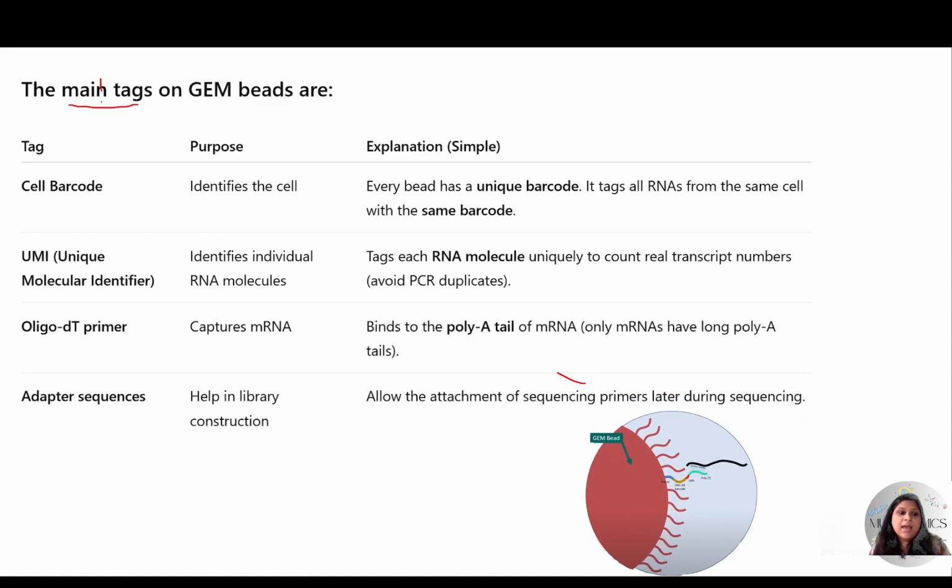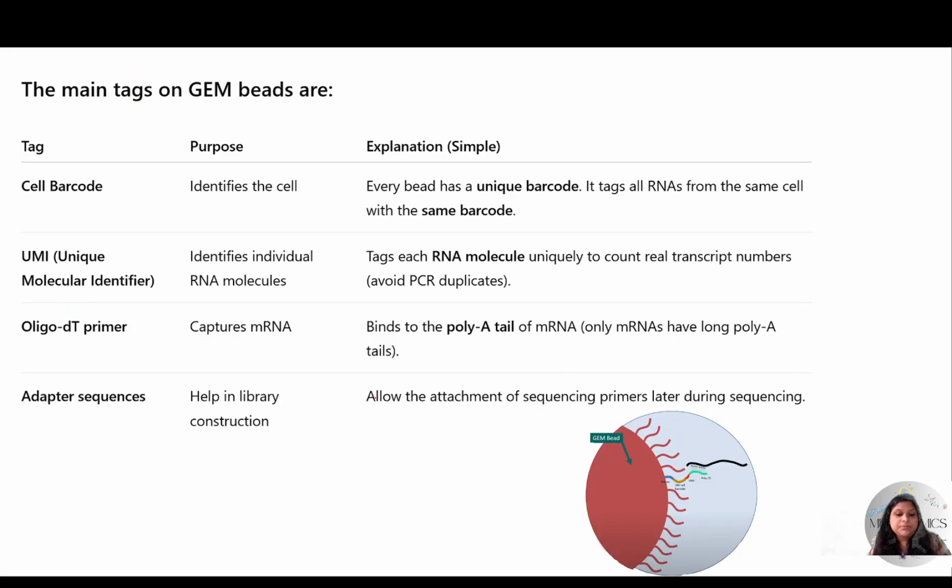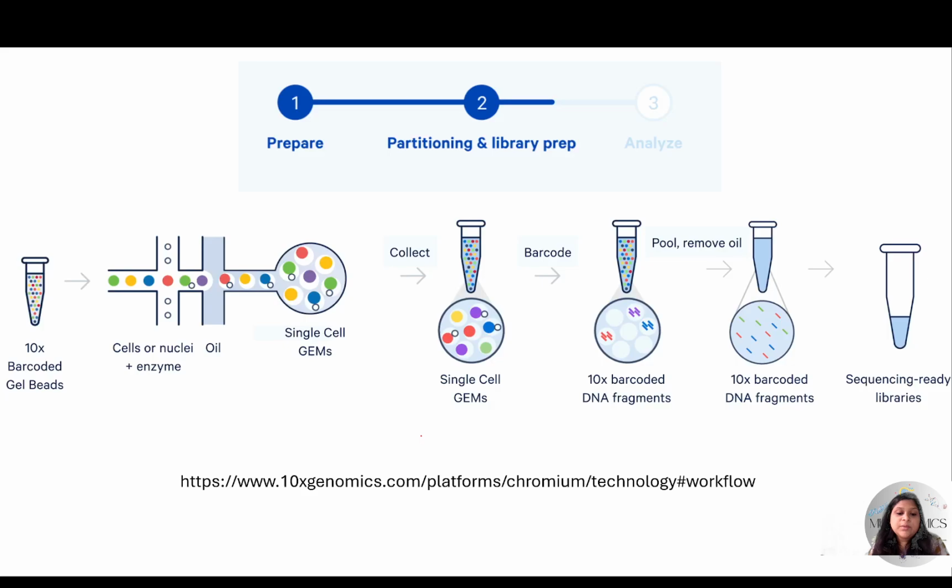The main tags on the gem beads are, I have put over here. You can go through that. And we also have adapter sequences, which help in library construction. You can go through this table later.